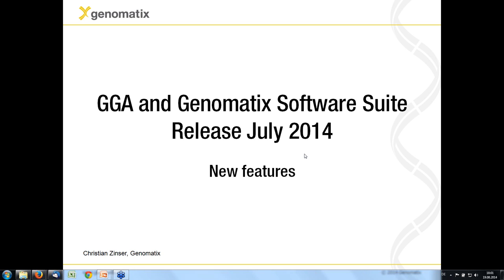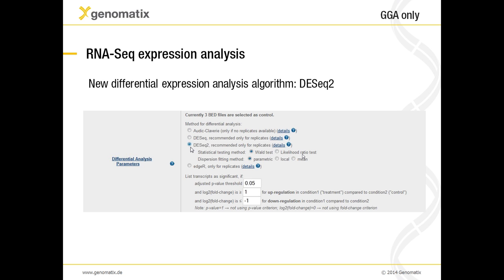Okay, so the new features in the GGA and Genomatix software suite in July 2014. First of all, a short overview using a few slides, and then I will also show a few of the features live in the software.